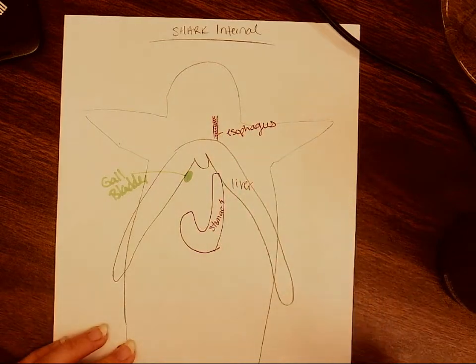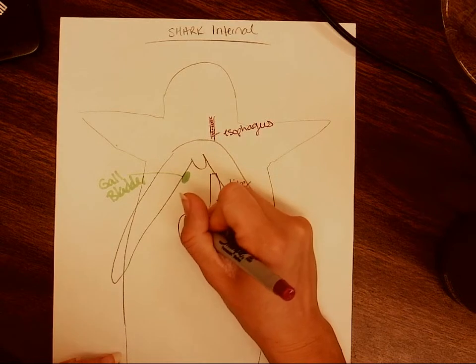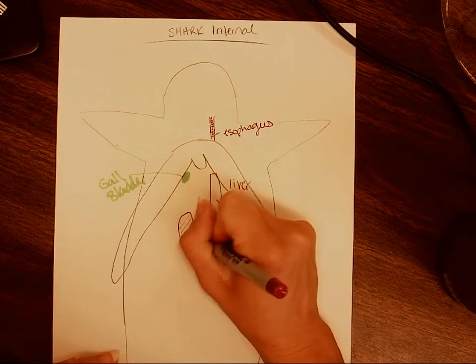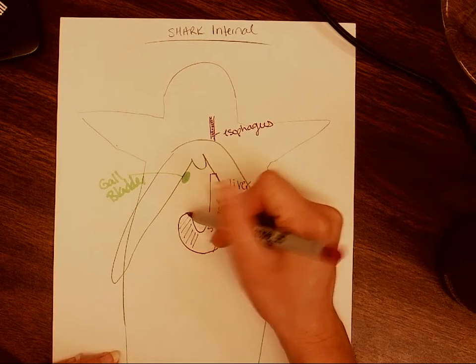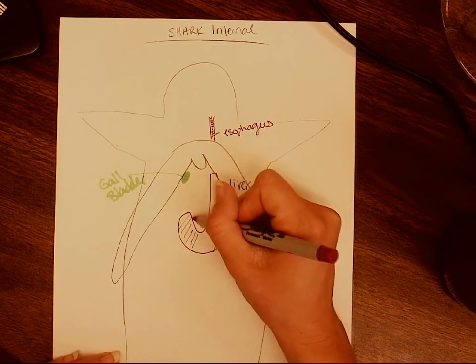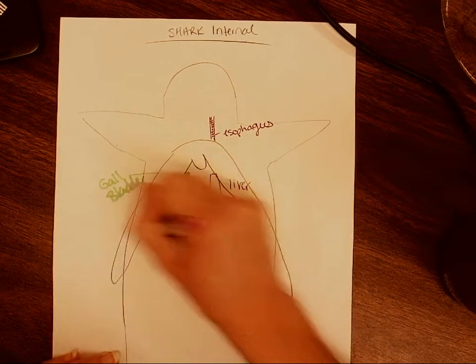Now, something special about the stomach here that is a little bit different than in the frog. When we get to the end of the stomach, right about here-ish in the top part of the curve of our J, this special section of the stomach is given the name duodenum.